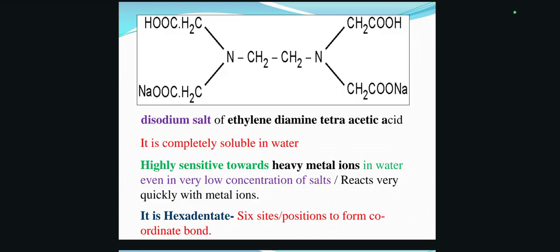Okay. And second most important thing, it is highly sensitive towards hardness causing metal cations, even in very low concentration. So that's why it is called a highly sensitive chemical toward metal ions. Who is sensitive? EDTA is sensitive. Okay, and it reacts very quickly with metal ions.